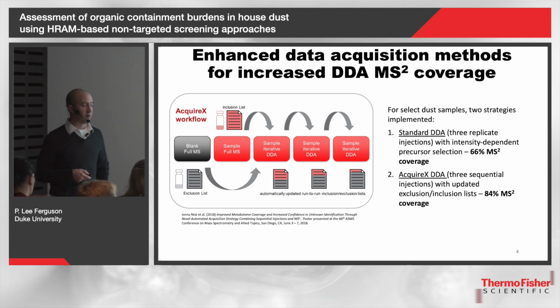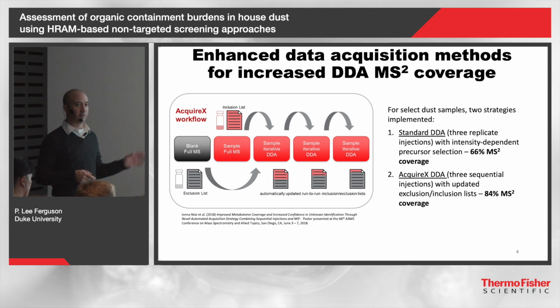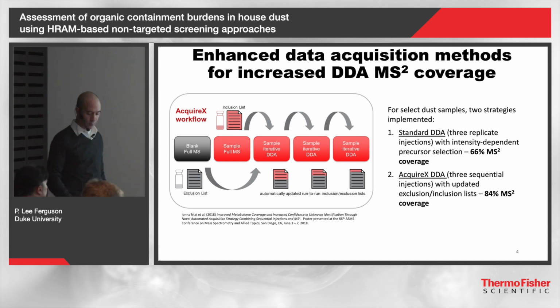There are still some challenges. There are compounds that just aren't being selected by AcquireX, and we're not sure why that is. We've been talking to some folks at Thermo about that. But this has really increased our coverage and allowed us to use DDA as a primary strategy, and we still believe we're getting a pretty wide swath of compounds identified.